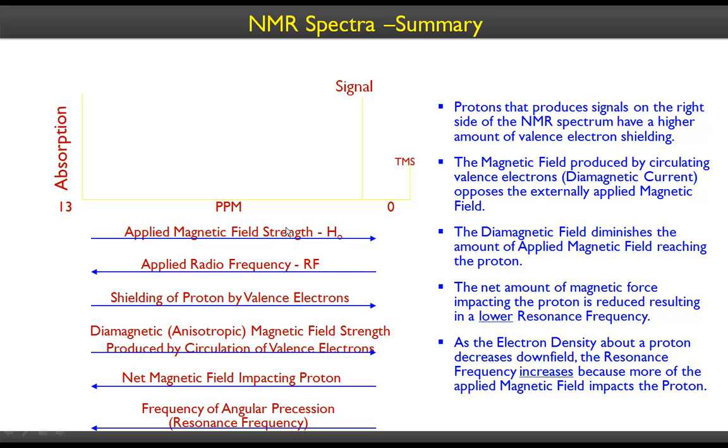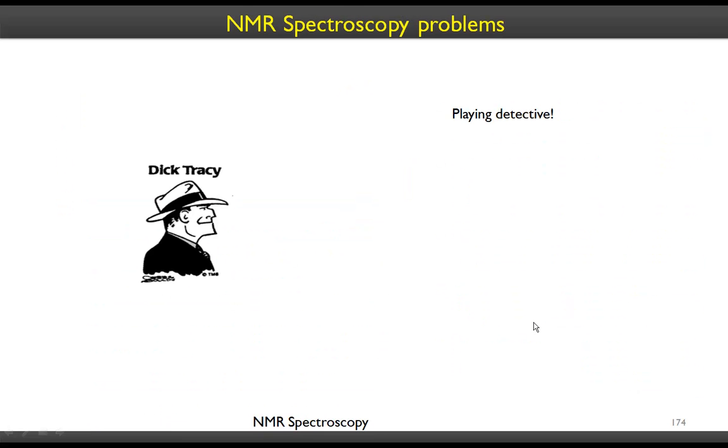So don't go by this one, okay. This is where, if you have a constant frequency, this is in the old NMR case where we had field as a variable. Now we have radio frequency, radio waves, as the variable. We keep the field constant. Anyhow, I'm going to skip some of the slides.